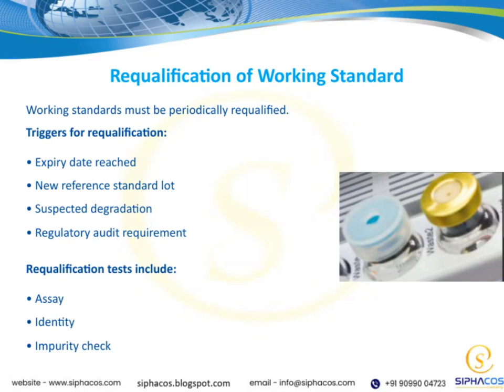Now, let's talk about the requalification of working standards. It's important to remember that working standards are not set in stone. They need to be periodically requalified to ensure ongoing reliability. There are several triggers that indicate when requalification is necessary. For example, when the expiry date on the standard has been reached, or if there's a new reference standard lot that we need to compare against. Other reasons include suspected degradation of the standard, which can compromise its integrity, or regulatory audit requirements that demand reassessment to stay compliant.